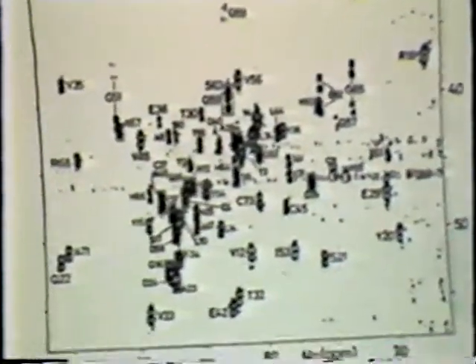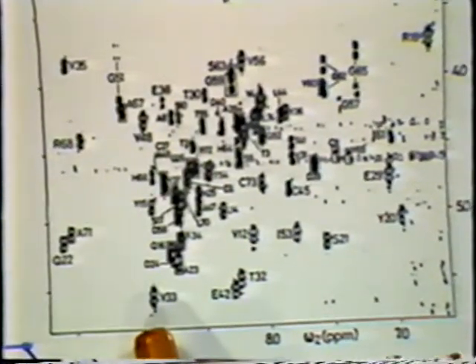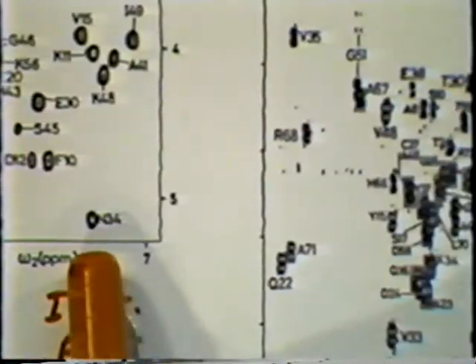This is an absolute intensity plot, and a phase sensitive plot has higher resolution, and also you can notice the multiplet of the cross peak. There are 4 peaks here, which are not visible, for example, in an absolute intensity plot, but they are better visible in the phase sensitive pure absorptive plot. So phase sensitive plots are very useful.